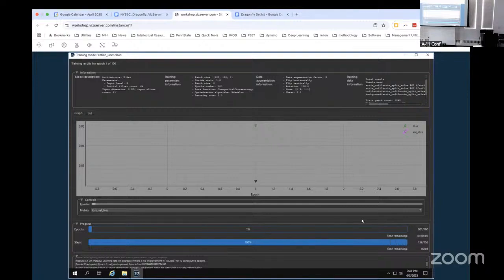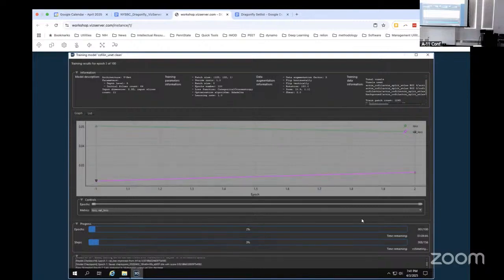You extract all of the different classes and regions, and then you combine them. So if you were starting from your own data set, you'd have to use the drawing tool. Yeah, exactly. And even if you manually set all the different classes and draw them, you can still combine those as a multi-ROI. Yes, absolutely.